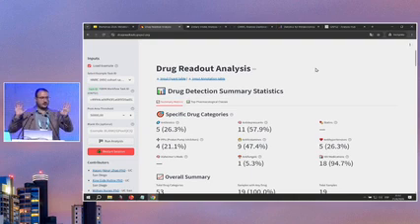Then you can look at both of them in another tool, the GNPS dashboard. You just use the USI, the identification for your specific spectra on the job, and it will show the annotation that has been populated for the specific spectra you're looking at.